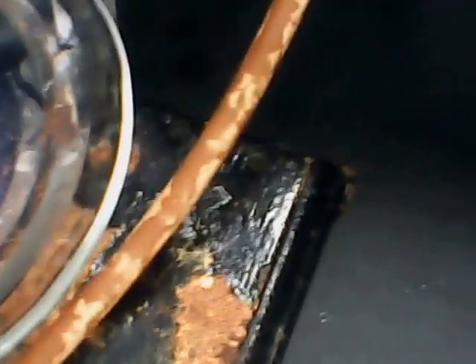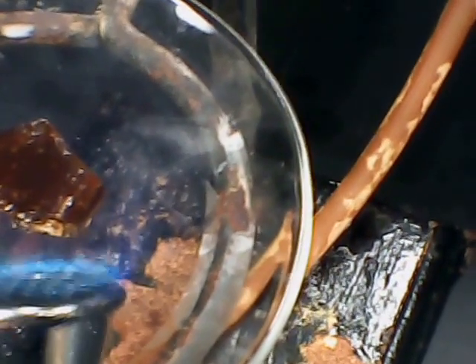I want to heat it up now on a watch glass and get an idea of the softening point and its properties. I'm heating it up with a Fisher burner here, just gently, to get an idea of what it takes to soften this.